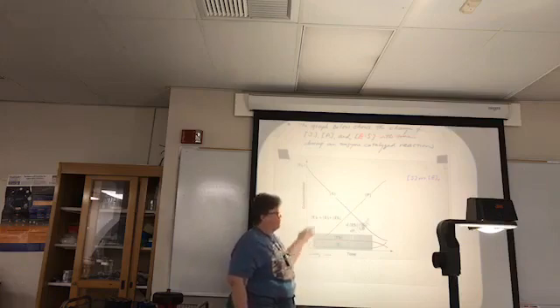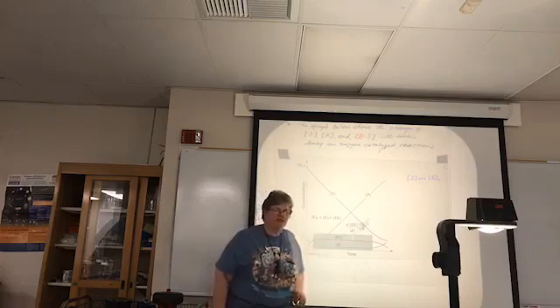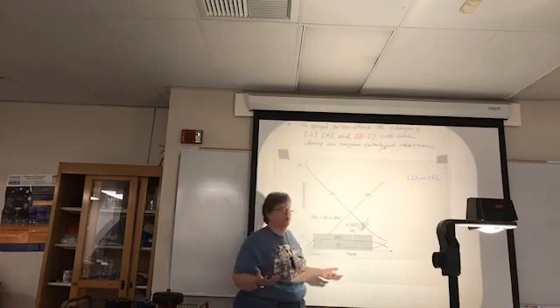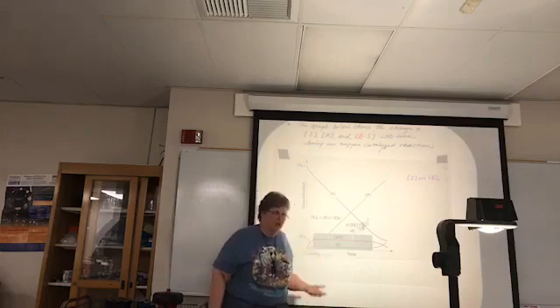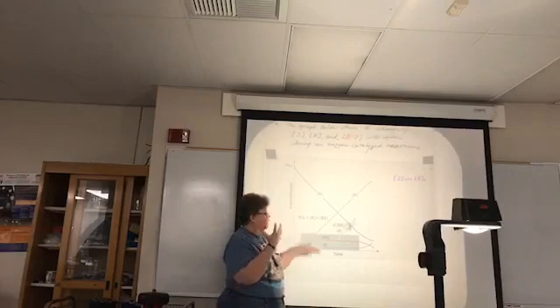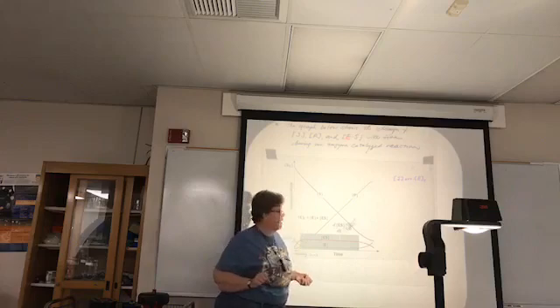Now please notice the concentration of the substrate is much, much higher than the concentration of the enzyme. If you have too much enzyme in the reaction, you're not going to be in steady state kinetics. It's going to grab all the substrate, turn it into product, and you're never going to be able to figure out a rate of a reaction using Michaelis-Menten kinetics. So Michaelis-Menten requires that you don't have an odd balance of substrate to enzyme. And that's one thing we're going to be checking in this experiment, making sure that we have enough substrate for the amount of enzyme that we are adding.